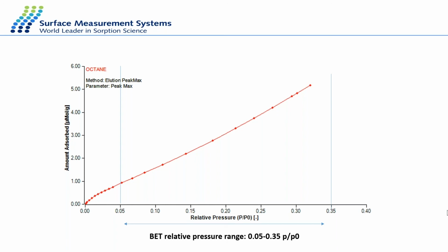In the case of our instrument, we designed the injection so that we have a target concentration that we inject, and at the end of the experiment there's an actual coverage, so we can see whether the sample really absorbed the injected probe molecules, or whether chemisorption happened.